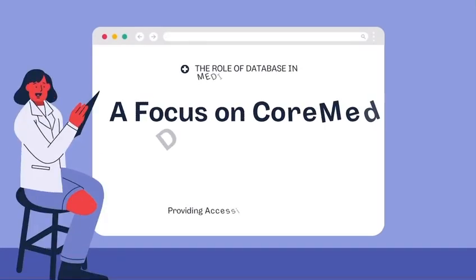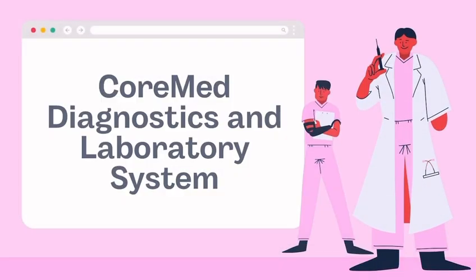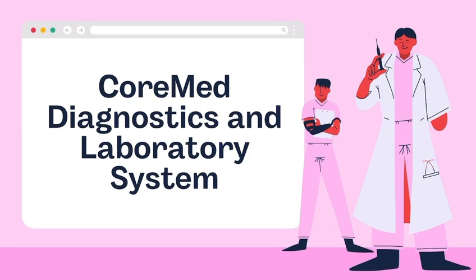Good day, everyone. Welcome to our demonstration of a vital tool in modern medical technology, the Health Information Database. Our featured system today is the CoreMed Diagnostics and Laboratory. It's a Microsoft Access database built to manage and streamline laboratory-related data, from patient information to lab test results. Let's explore how this system works, how it improves healthcare data handling, and how it reflects the essential role of databases in the medical field.